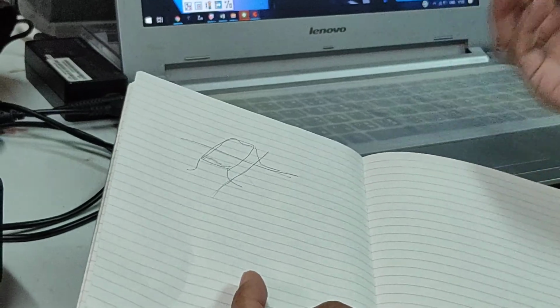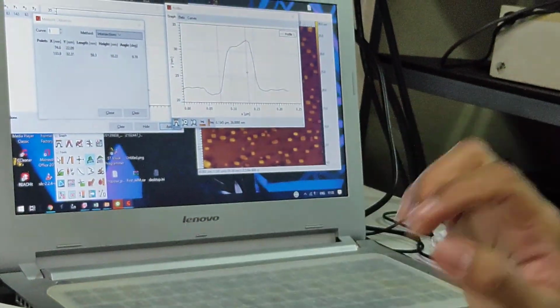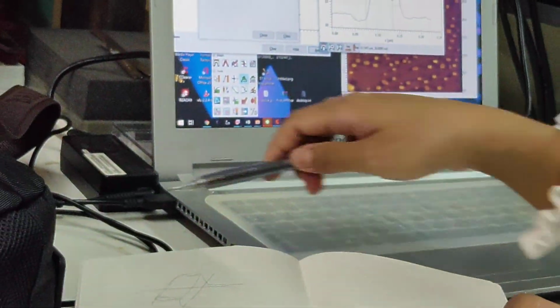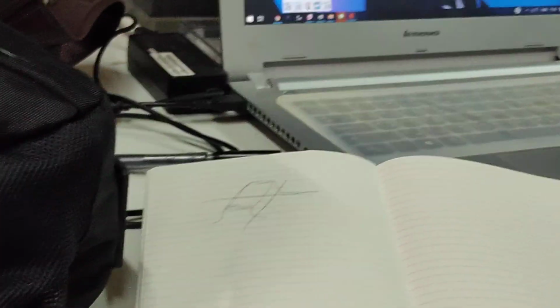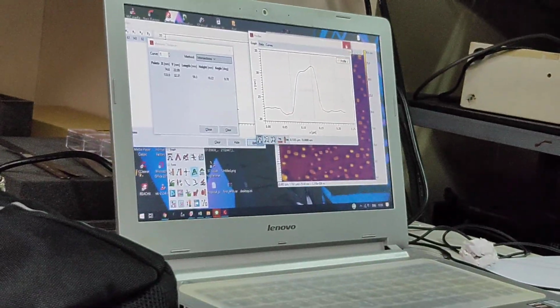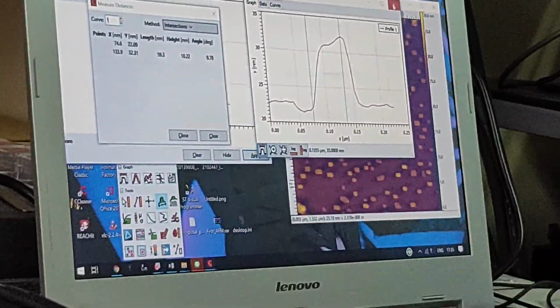This is the first. We don't need to decide between here or here. For me, the easiest way is to take the largest values. That's it. However, after that we will do averaging, so it is not much different.